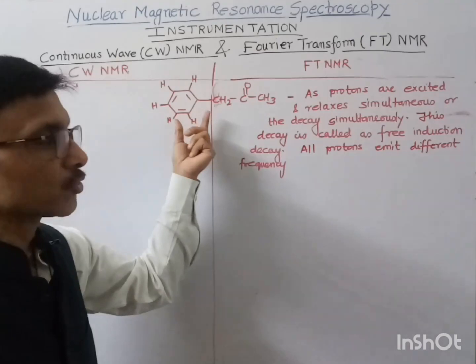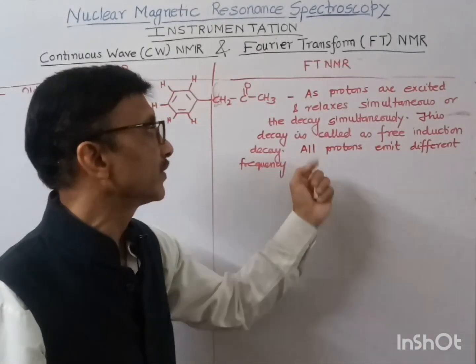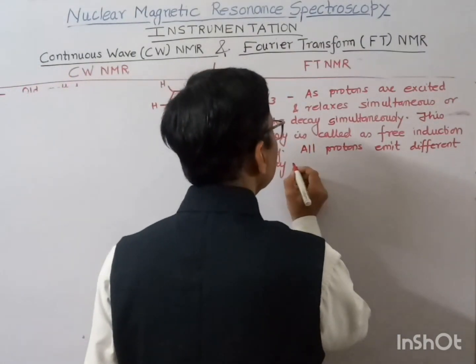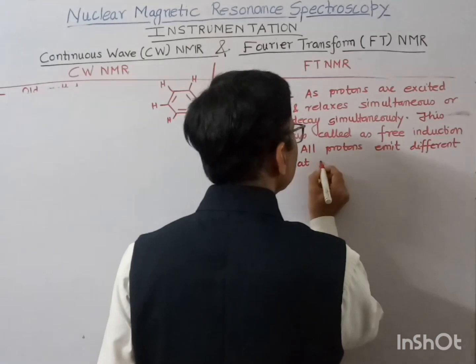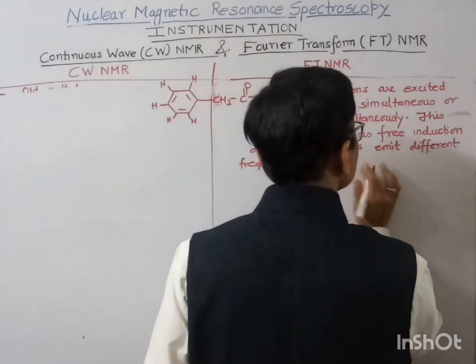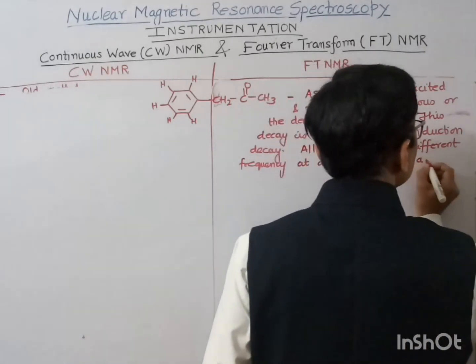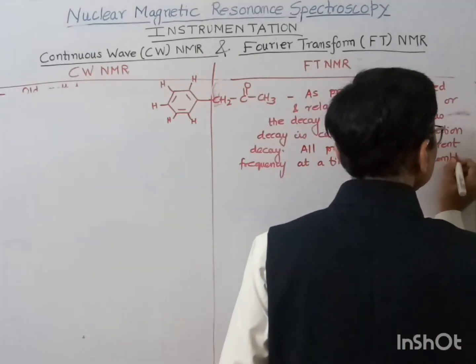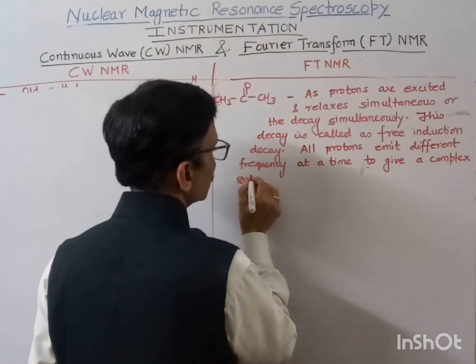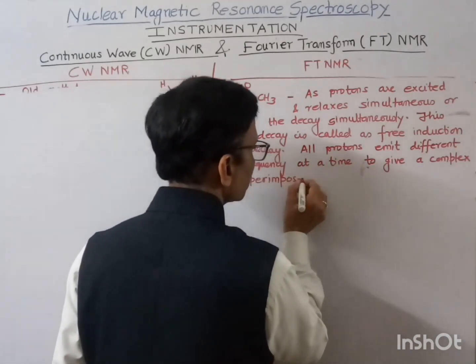Here 3 types of proton are there, so all 3 protons emit different frequencies at a time to give a complex superimposed spectra.